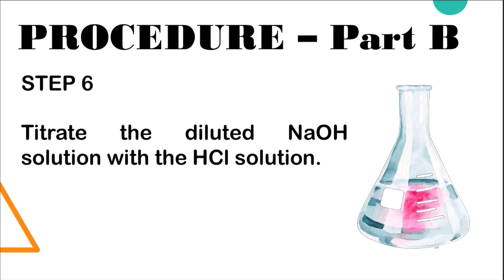Step 6: titrate the diluted sodium hydroxide solution with the hydrochloric acid solution.